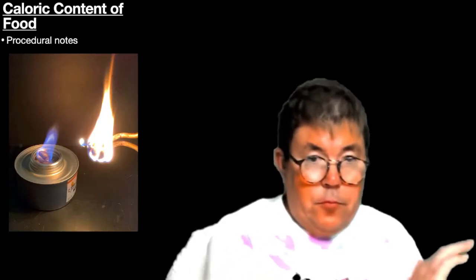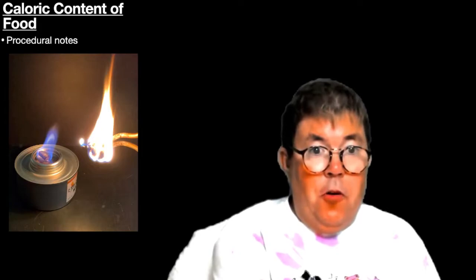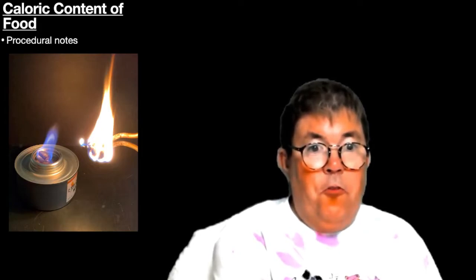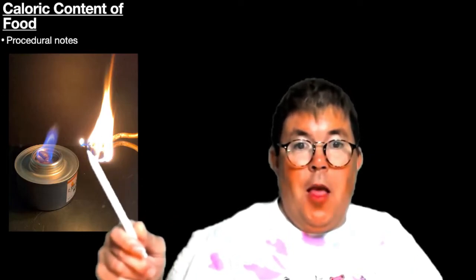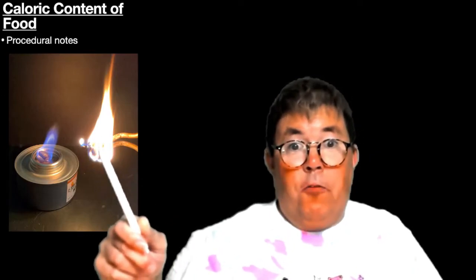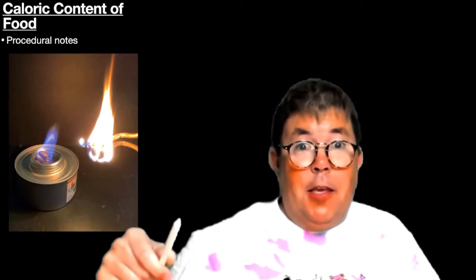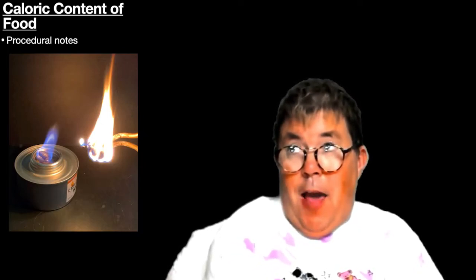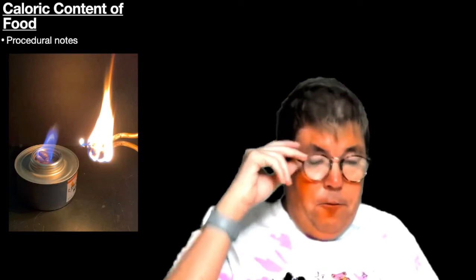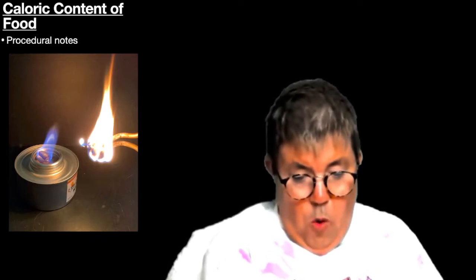Lastly, look at the picture of the burning food. We want to make sure that the food is fully engulfed in flames before we put it underneath the calorimeter. If we do not have the food fully engulfed in flame, it may go out before it ever gets a chance to heat the water.